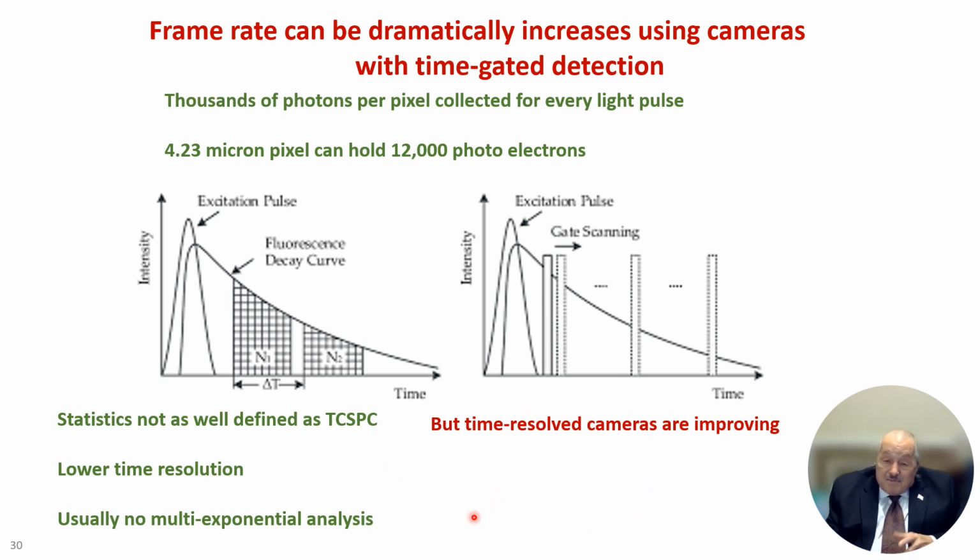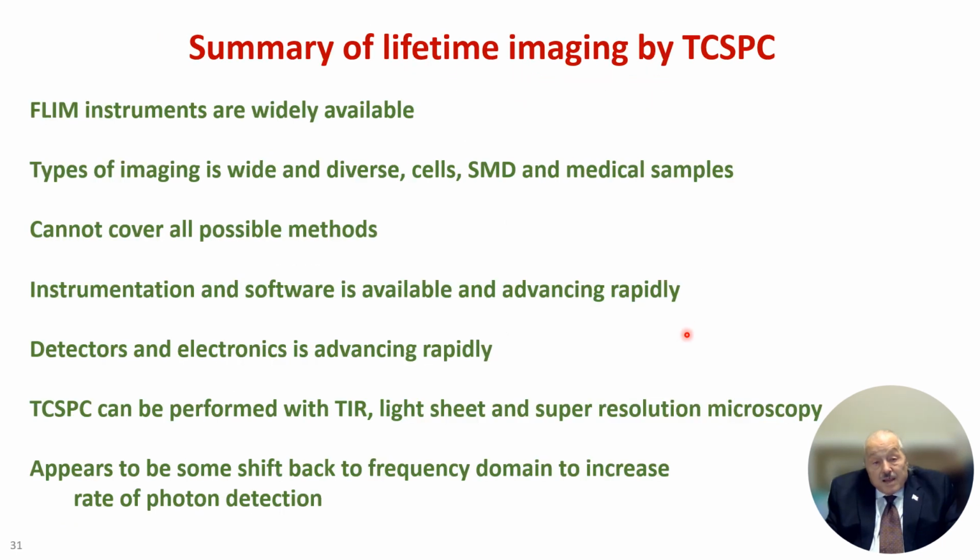So the cameras are getting better now. Usually there was no multi-exponential analysis. The cameras are probably getting good enough. We'll probably start to see even more complex analysis with camera gating.